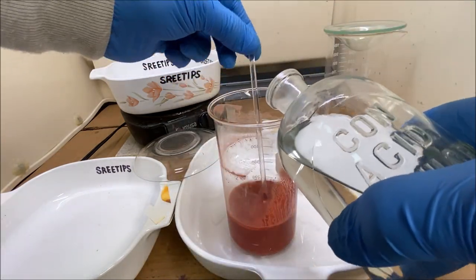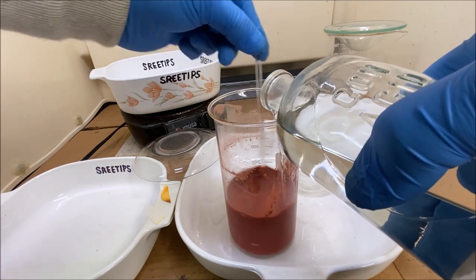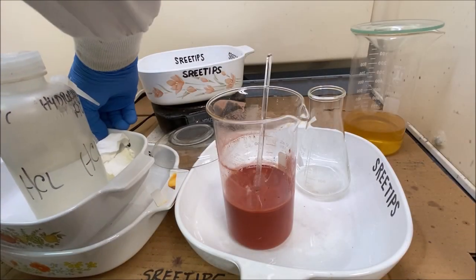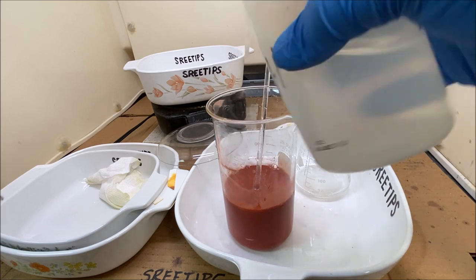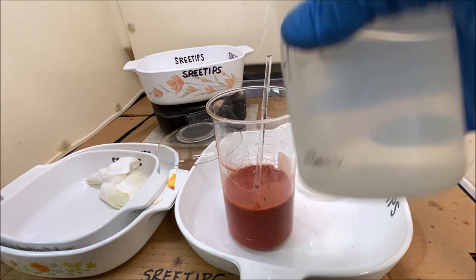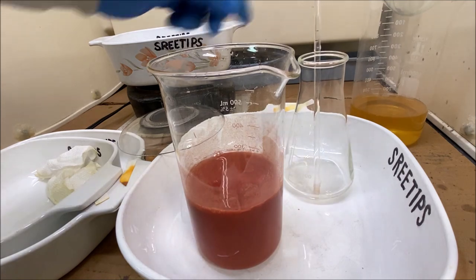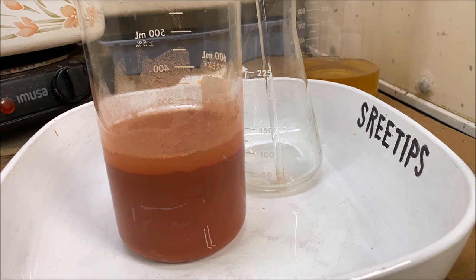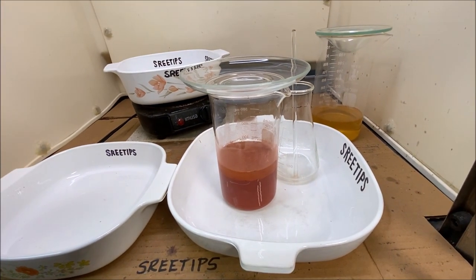We can't use water to rinse the precipitate because this precipitate is soluble in water. This hydrochloric acid rinse probably got a little bit of the ammonium chloride off of that precipitate for us.